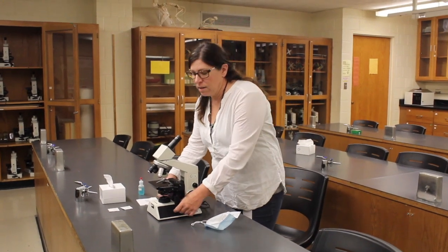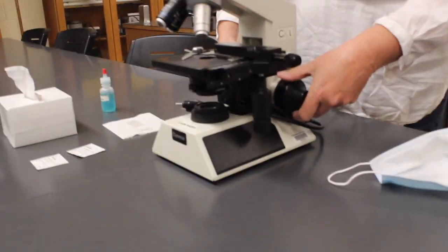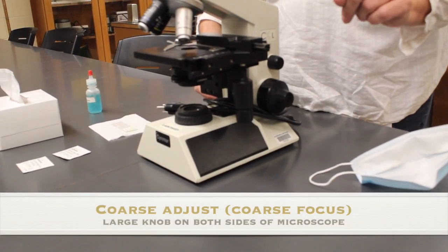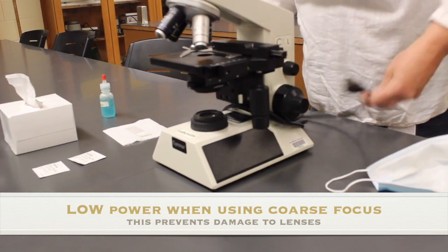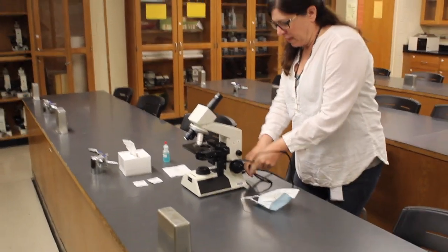Once you get back to your station, you're going to unwind the cord from the base very carefully. It's a little tricky here, and sometimes you might have to raise the stage up a little bit. To do that, you're going to use the coarse adjust, and you can see that that raises the stage up. If you do that, be sure you're on the low power. So you're going to unwind the cord from the microscope and plug it in to a nearby electrical outlet.